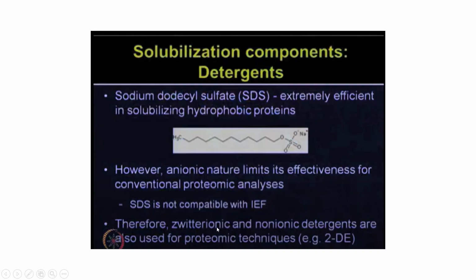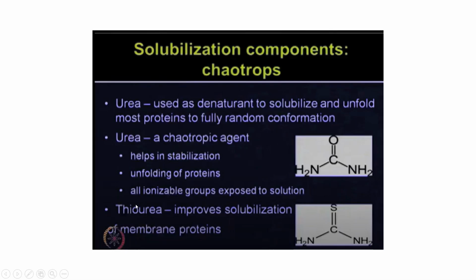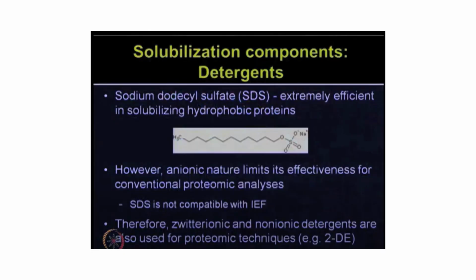So SDS is basically not compatible with IEF. You just asked whether urea and thiourea are compatible. I'm not exactly sure whether they are compatible or not, but according to me, they might not be.